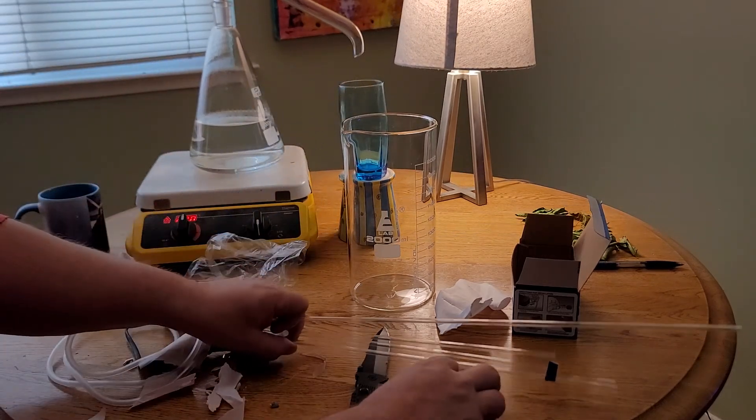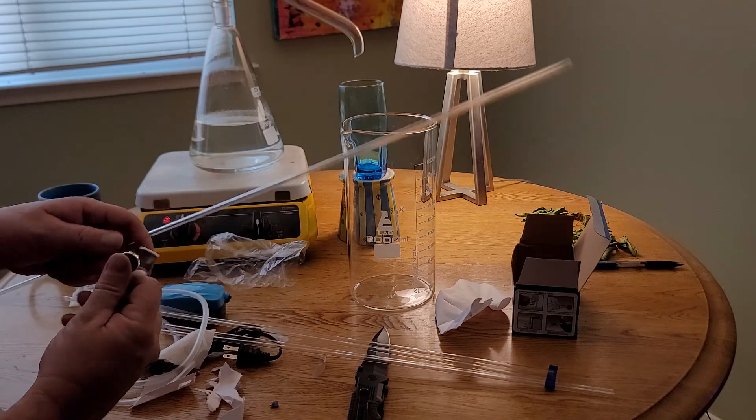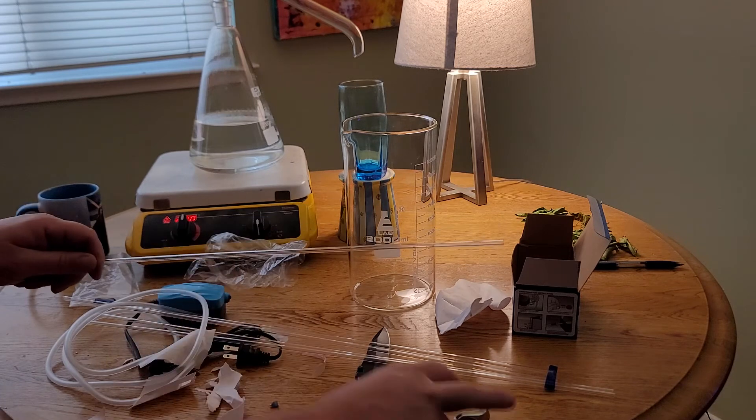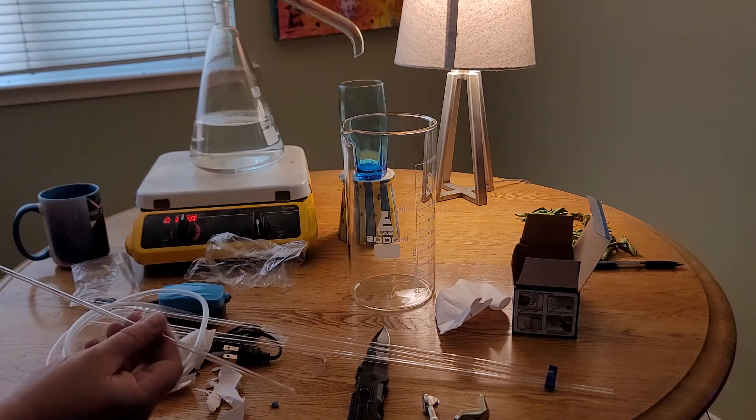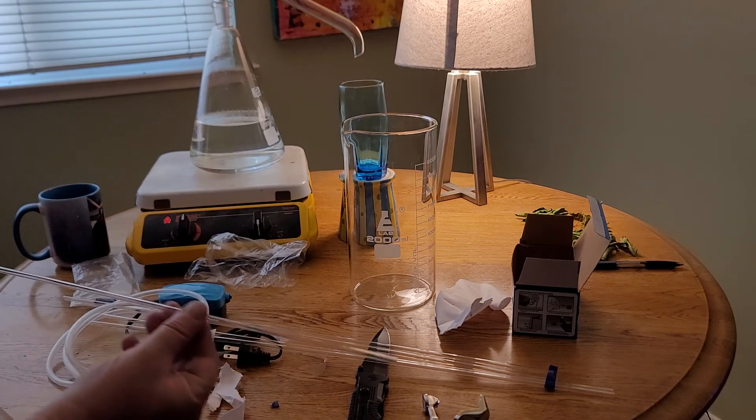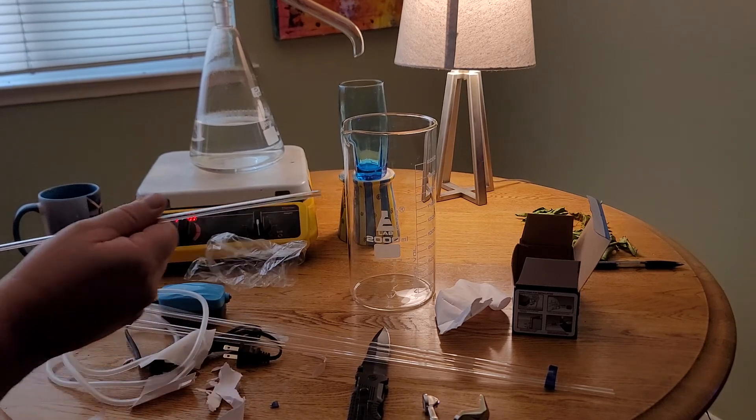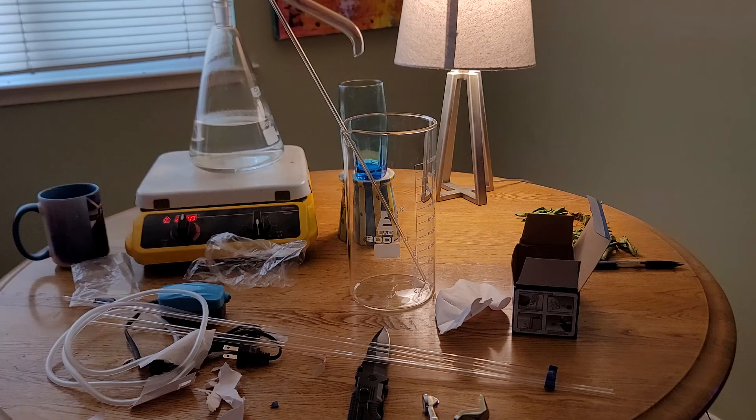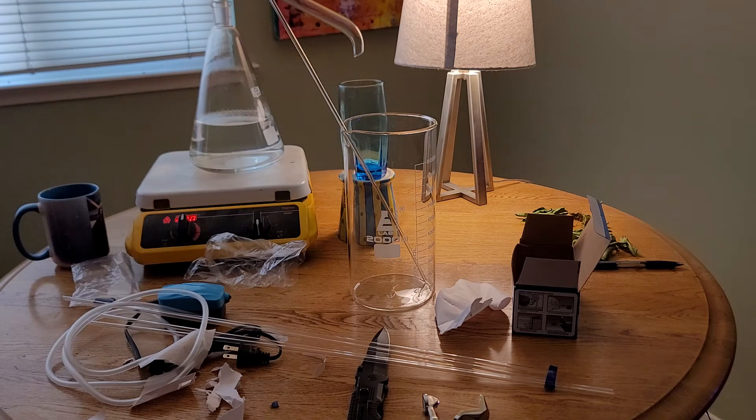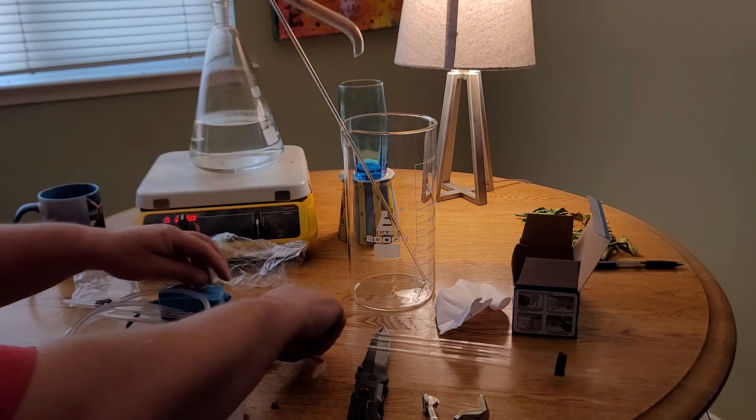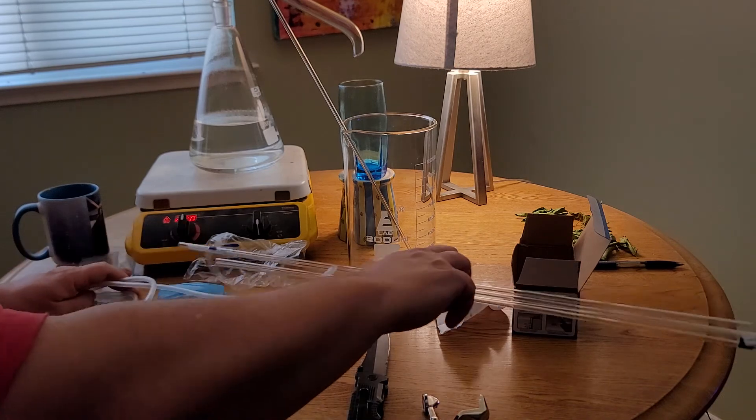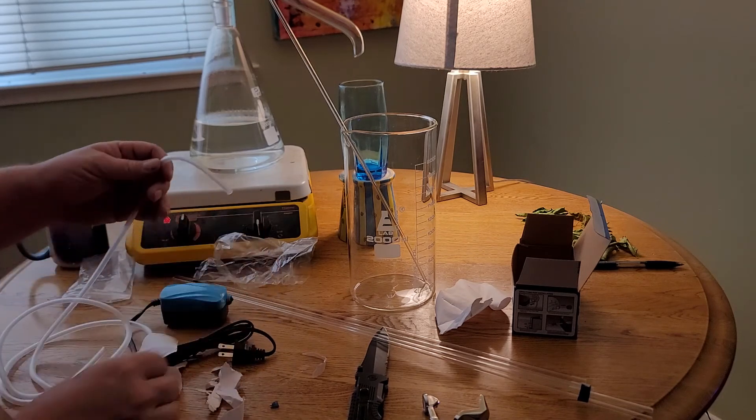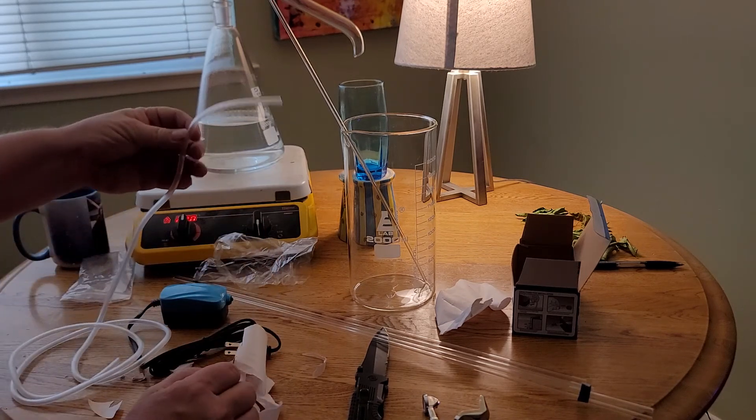And then with this glass cutter, I should be able to score this and snap it off and cut it to length. And then I may do some heating and bending, kind of like a straw, because this is designed to go in the beaker like so and connect the aerator pump to it with the tubing.